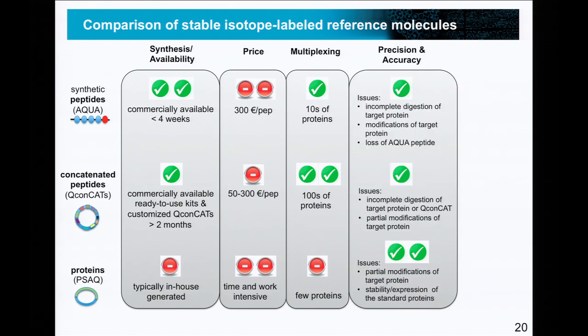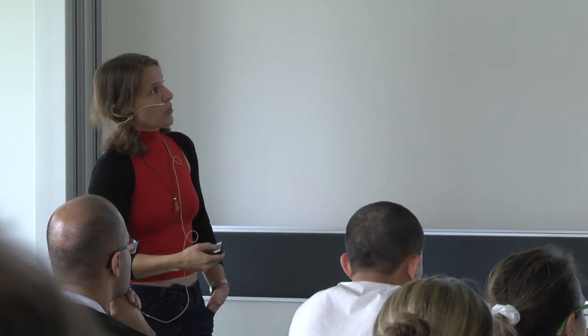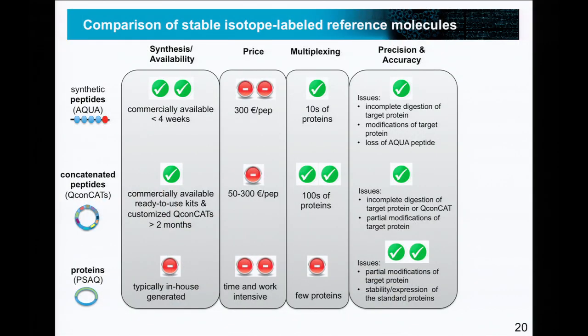And finally, precision and accuracy. The most precise and therefore also most accurate approach of these 3 molecules are definitely the protein standards.